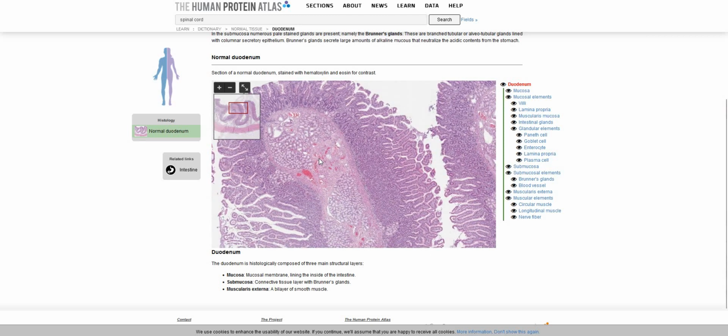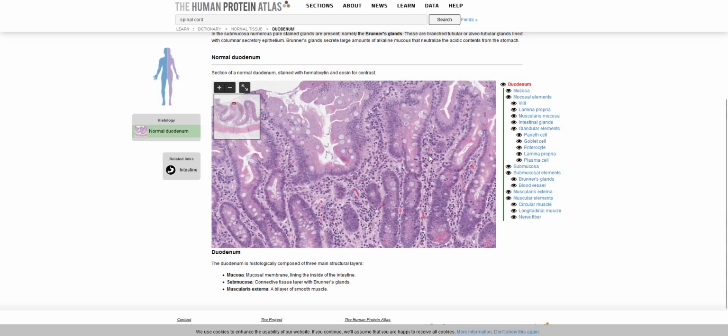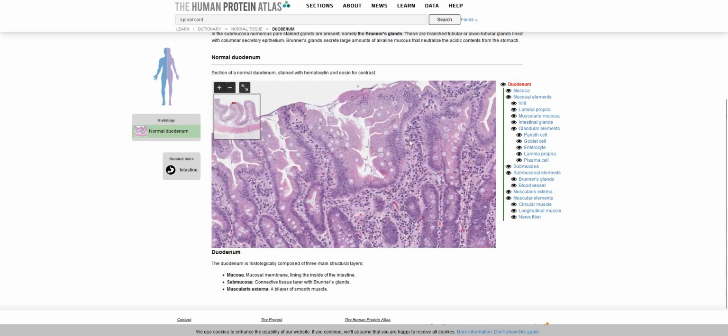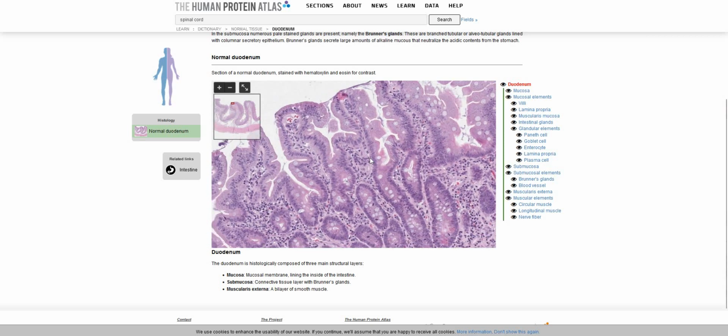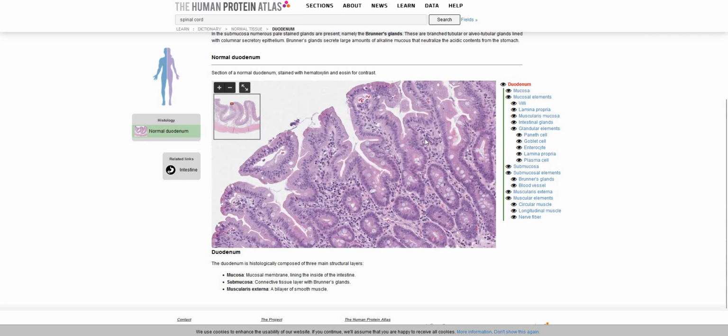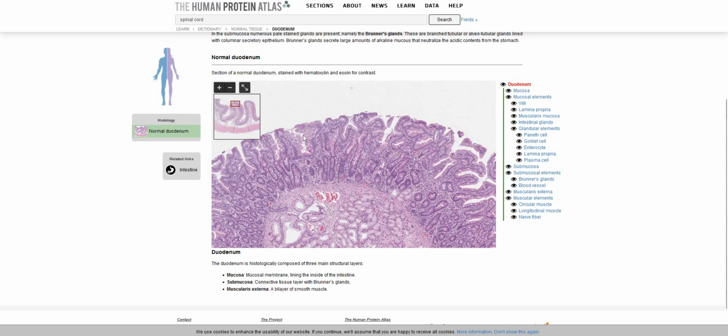As we move further along the tube, the waste product will get pushed towards that terminal part of the small intestine before it enters the colon. We will see the same pattern within the mucosa, where we have goblet cells, which are these guys in white that you can see here, kind of scattered all along the surface of those plicae circularis. On our plicae, we've got these additional folds called villi.